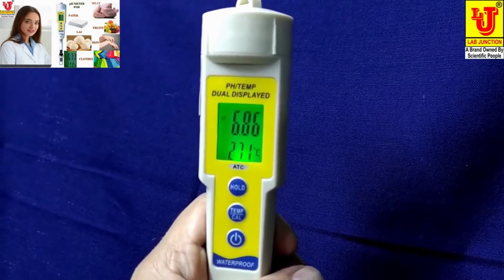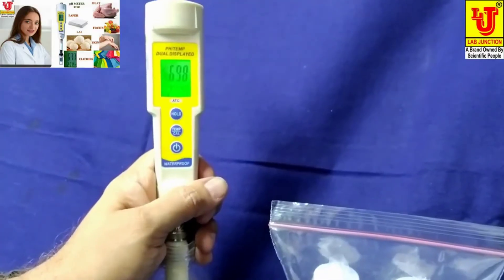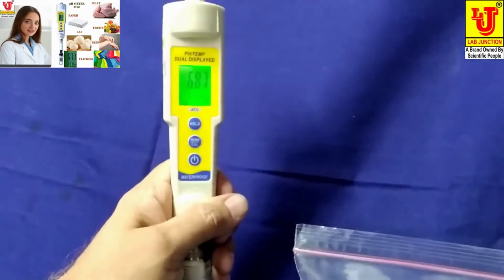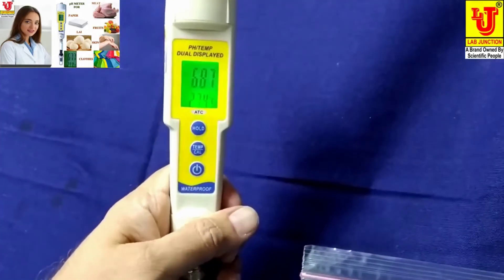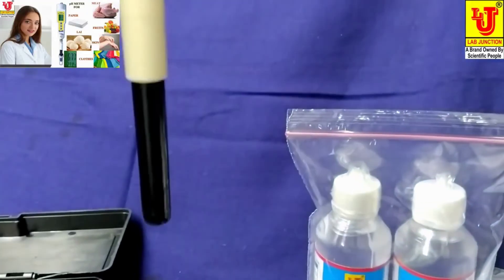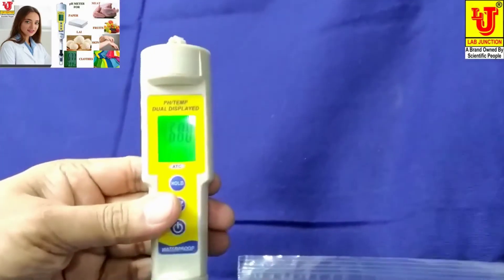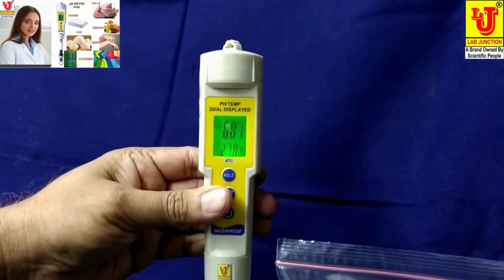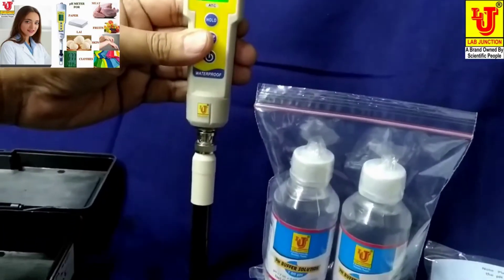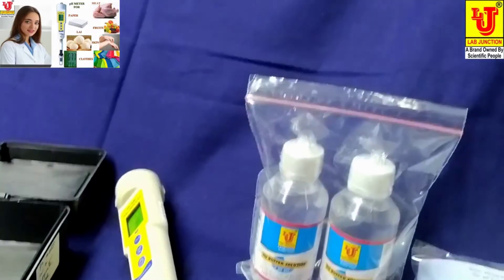Our pH meter is calibrated and ready for use. Now, if you want to check the pH of cloth, just touch the pH electrode to the cloth. This cloth has a pH value of 6.85. In this way you can check pH for various applications.